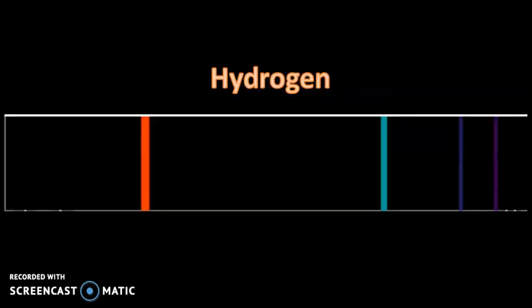as the official spectrum. Now this would have been taken in absolute perfect conditions with a perfectly polished prism in a perfectly dark room to be able to get a crisp image like this. And that unfortunately is not necessarily what our classroom conditions are.